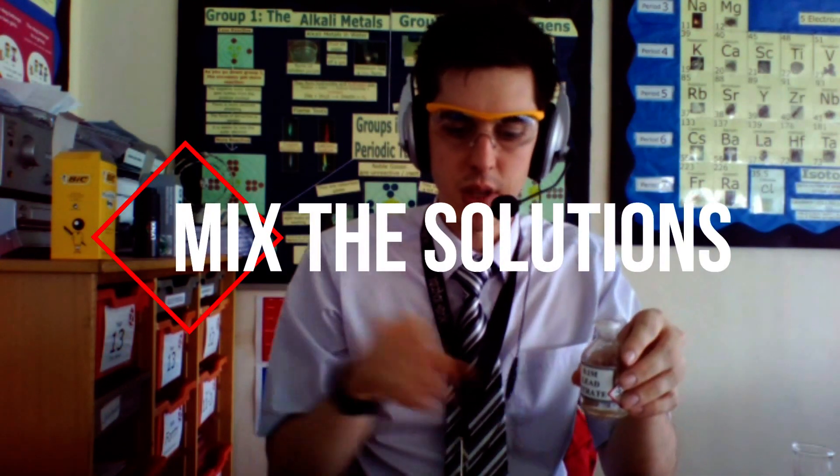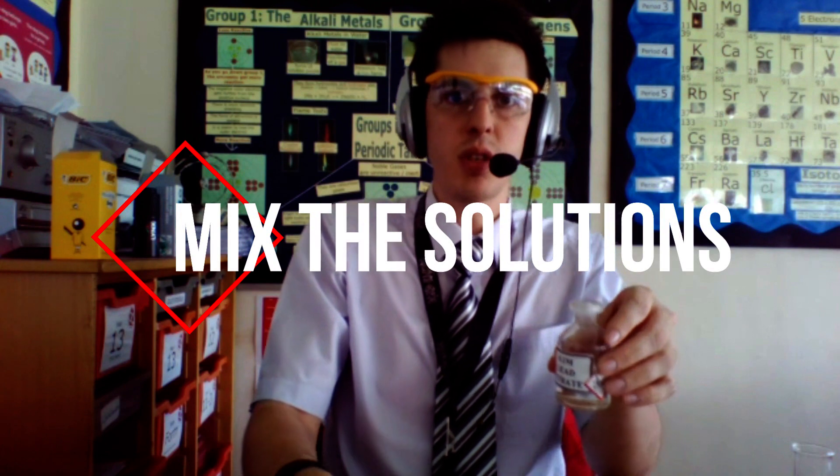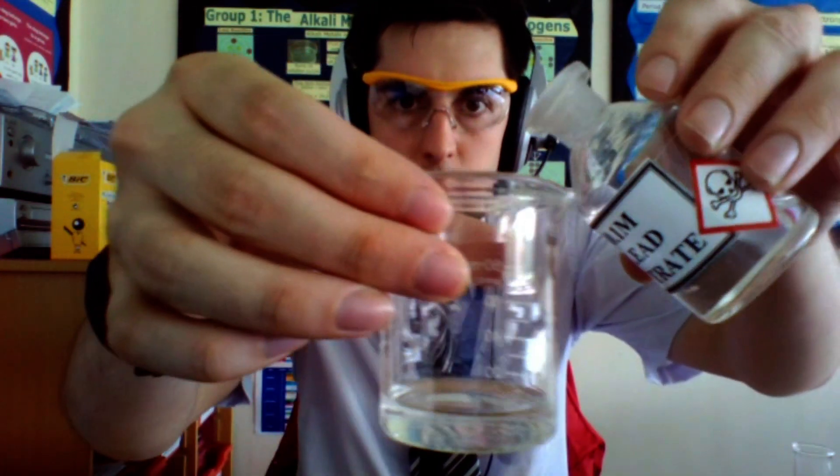The next thing you want to do is mix it with your other soluble salt, so in this case lead nitrate. You'll see straight away the precipitate forming.